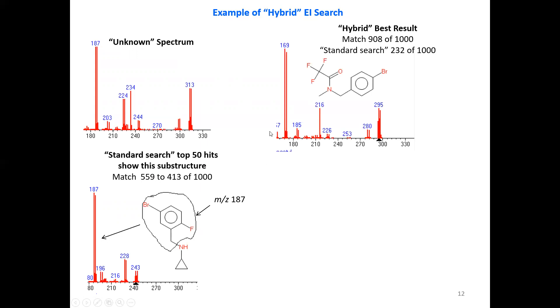So now we're going to do the hybrid search and look at the hybrid results. We'll further look at the neutral loss spectra. And when you do that and merge the scores of the standard plus this neutral loss fit, you'll find this compound. It had a fit of 908 out of 1000. And so it's a very high fit and it's very worth considering. And if you looked and found where it would be in the standard search, it would be at a fit of 232 out of 1000. So you would never go that far down to look for it.